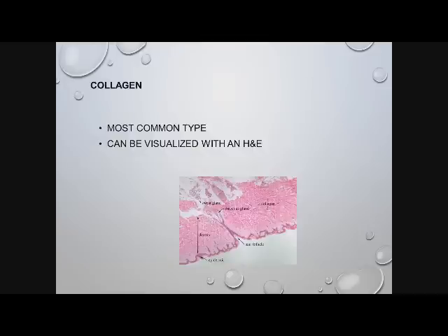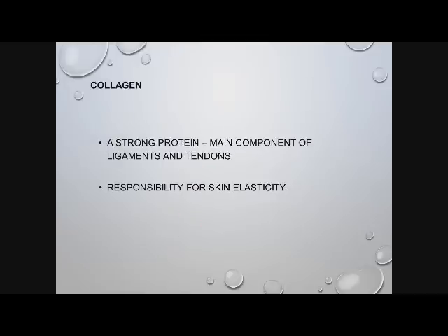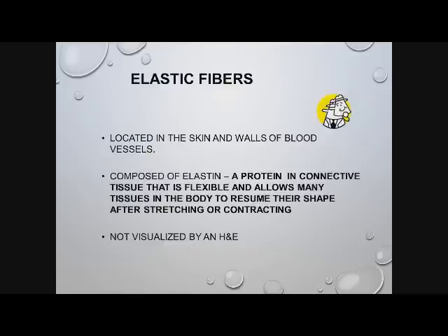Collagen is the most common type, and it can be visualized with an H&E. Collagen is a strong protein. It's the main component of ligaments and tendons, and it's responsible for that wonderful skin elasticity, which I can assure you does decrease as you get older.